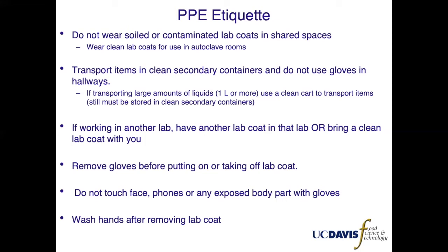The idea is that your lab coat is contaminated, so once you touch it again, your hands are then contaminated again. Washing your hands after removing your lab coat removes any hazard that was on your lab coat from your hands.